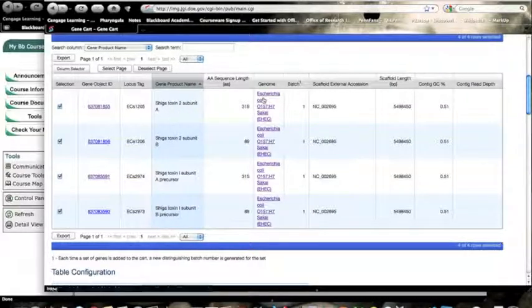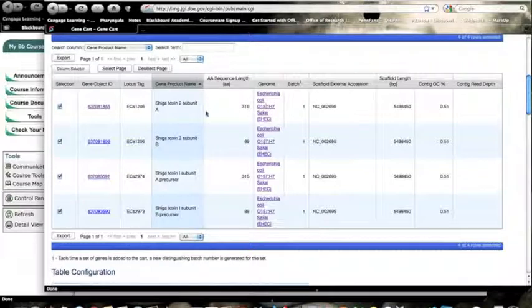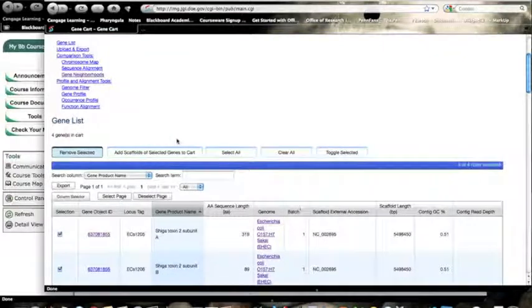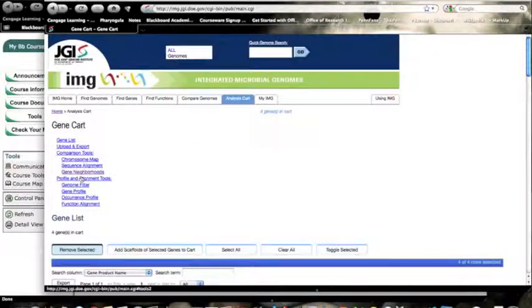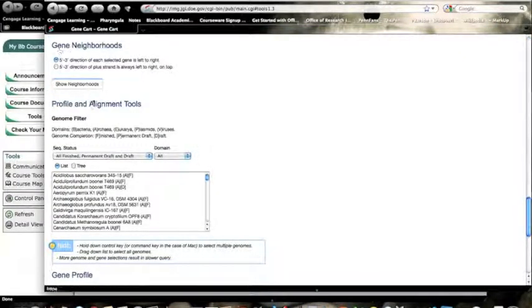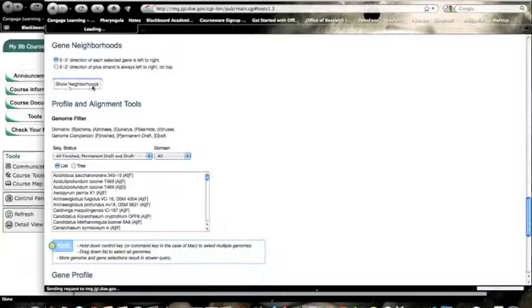Now let's just look for the sequence of one of these. So we see there's E. coli, the pathogenic strain. It's got the Shiga toxin in it, two versions of this. And just for fun, let's look at the gene neighborhood. Click there. It'll take us to this part. And then you hit show neighborhoods.